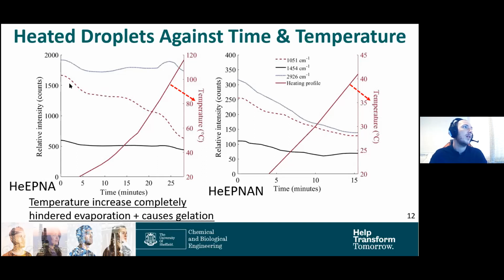And then, of course, we've got more activation energy, which could allow for these gelation reactions to occur in the aluminium groups. And then, like we said before, we couldn't heat this droplet up as fast because it just reacted so fast. It really wanted to do those gelation reactions as soon as you've got that nickel nitrate in there.